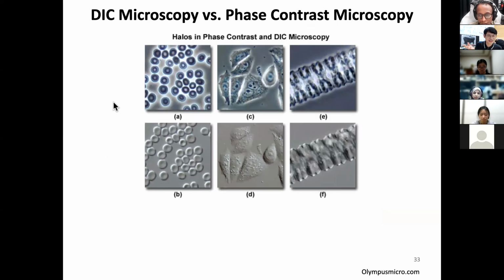I want to give you the images of various contrast mechanisms, and you should be able to tell. Look at that. The upper ones are phase contrast. It doesn't have orientation, but has an excellent contrast from the phase, you can see. And exactly the same sample, if you are using a differential interference contrast microscope, unfortunately, this one didn't get a Nobel Prize, because usually it's given to the first groundbreaking idea, but it's also very fine. You can see nice, three-dimensional, shadow-type images out of this.